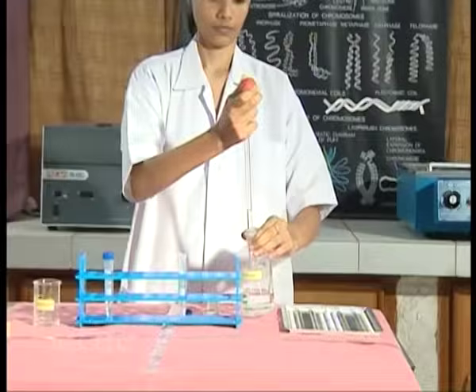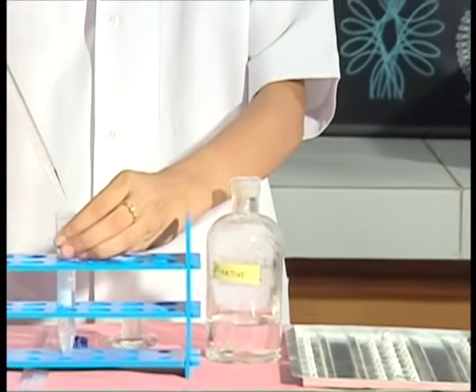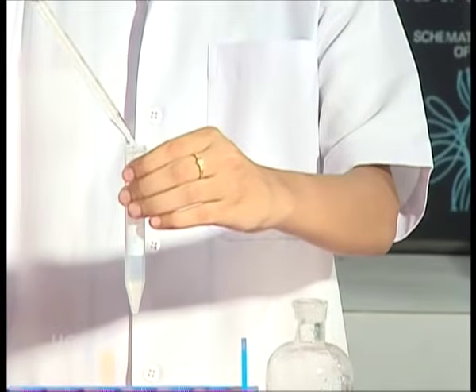The fixative used here is 1:3 acetomethanol, which should always be freshly prepared and chilled.